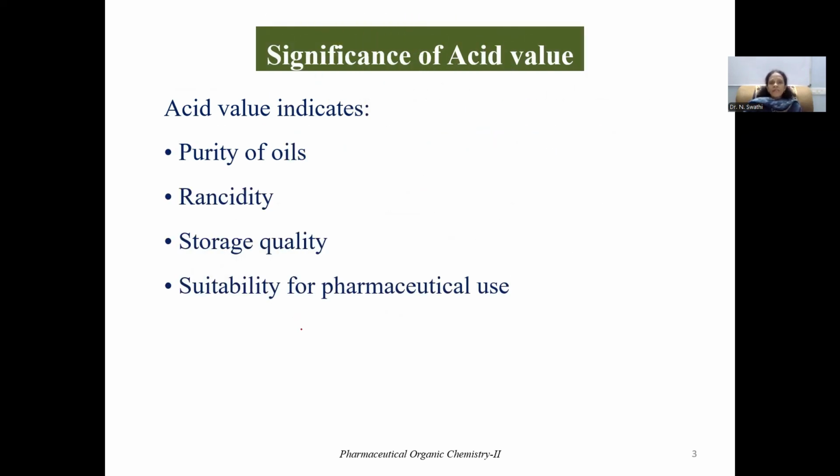Now let us see the significance of acid value. By determining the acid value of the given sample of oil or fat, we can identify the purity of oils and rancidity can be identified. Rancidity is nothing but unacceptable odor or taste of the oil or fat. So this rancidity may be arising due to hydrolysis or oxidation during its storage conditions.